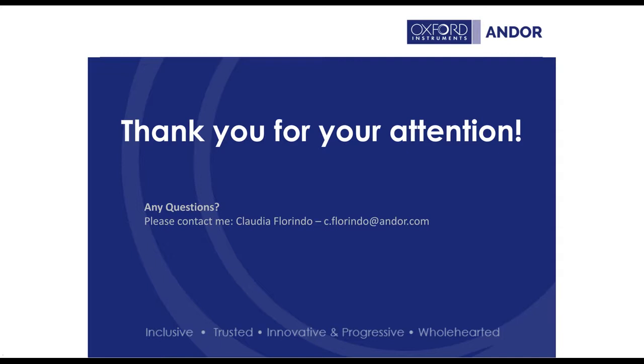Thank you so much, Claudia. We've got another last question. I think this is also for you. For multiplex imaging, how is the interaction between the Dragonfly and the external devices achieved? So thank you so much for that question.